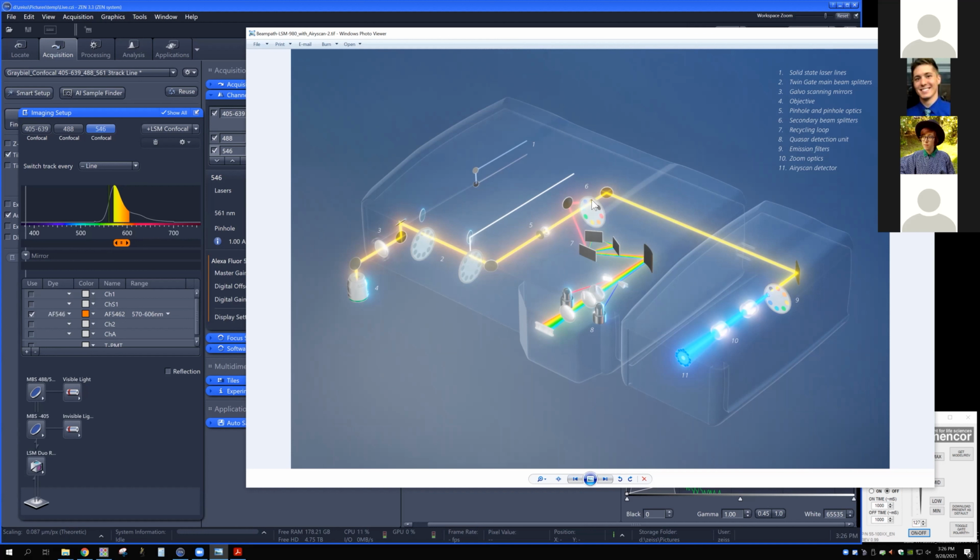We cross one filter wheel and a second filter wheel to get there. So this is the first decision point, the first choice that you make: what wavelengths you want to send to the Airy Scan. And then we can trim these down even further using the second detector element. So it's the combination of these two that's going to dictate what wavelengths reach the Airy Scan detector.